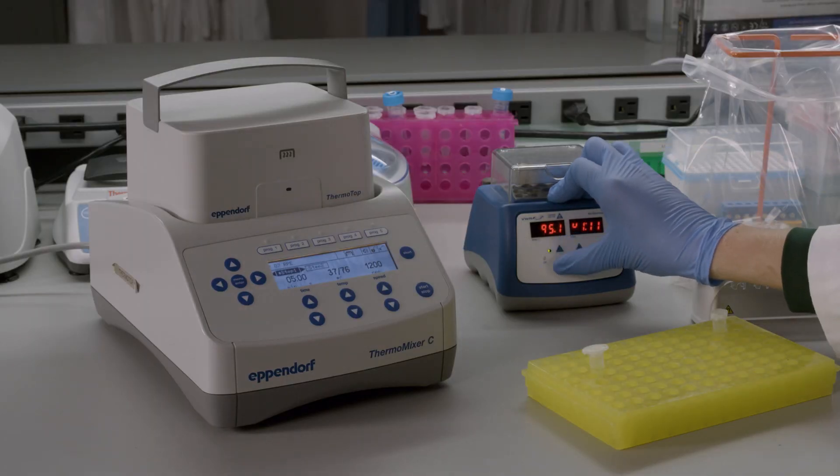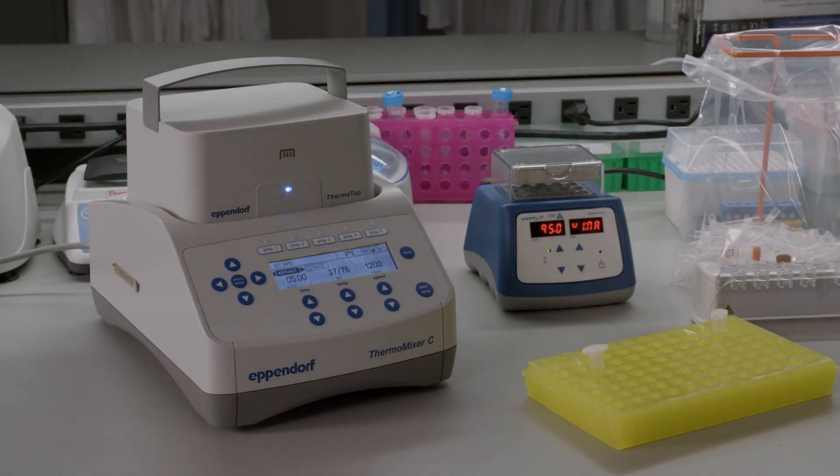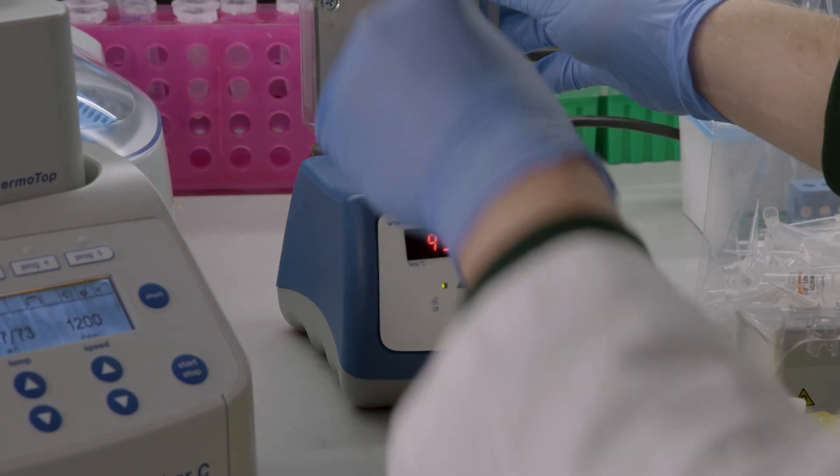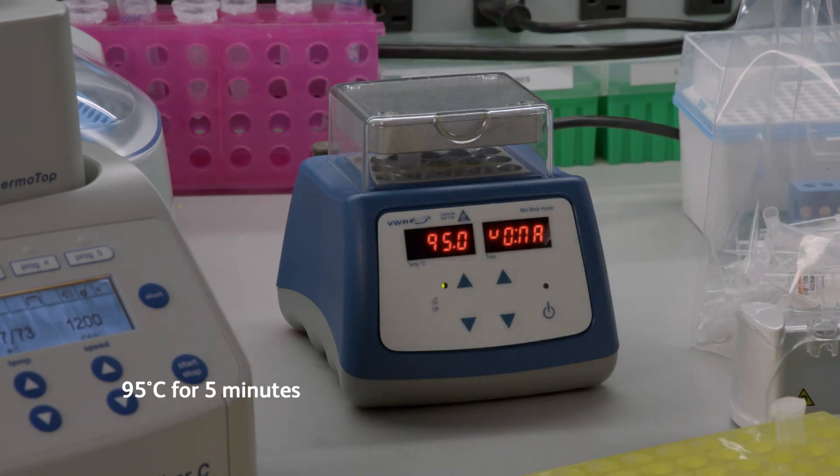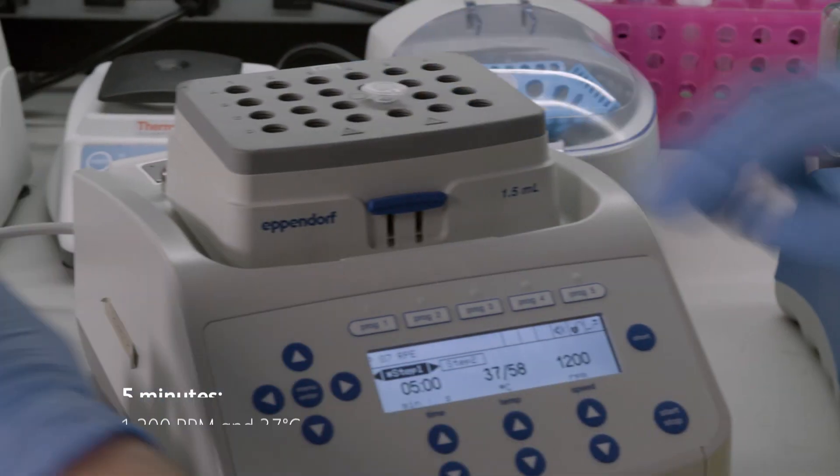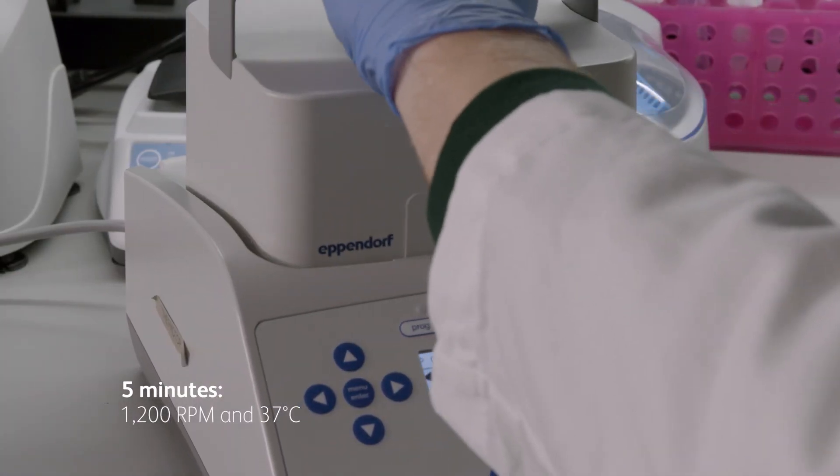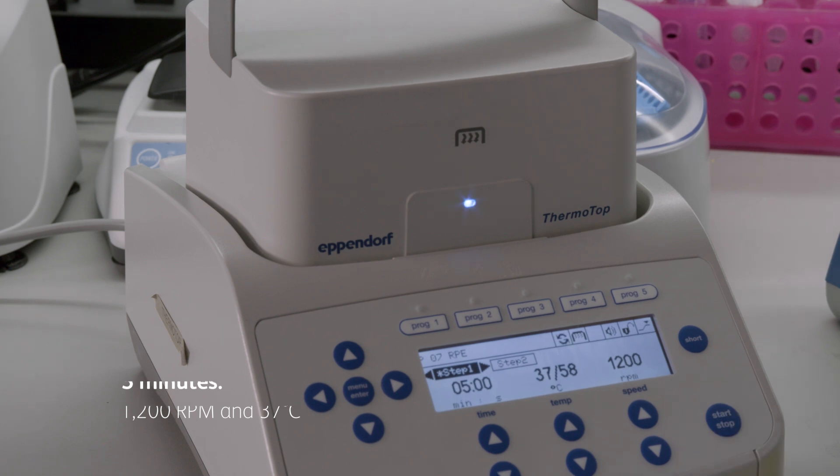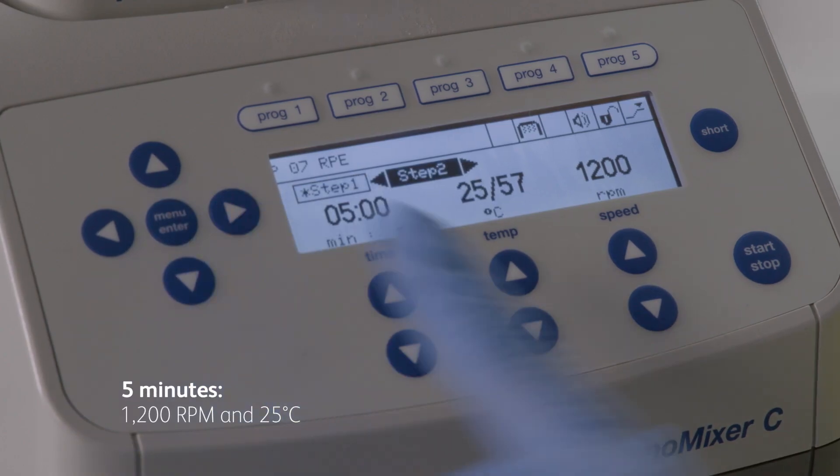Now, incubate this reaction mix in a specific three-step order and prepare the extension enzyme mix while the incubation takes place. To incubate the reaction mix, place the tube in the heat block at 95 degrees Celsius for 5 minutes without shaking. Next, use the thermomixer for 5 minutes at 1200 RPM and 37 degrees Celsius. Finally, use the thermomixer for 5 minutes at 1200 RPM and 25 degrees Celsius.